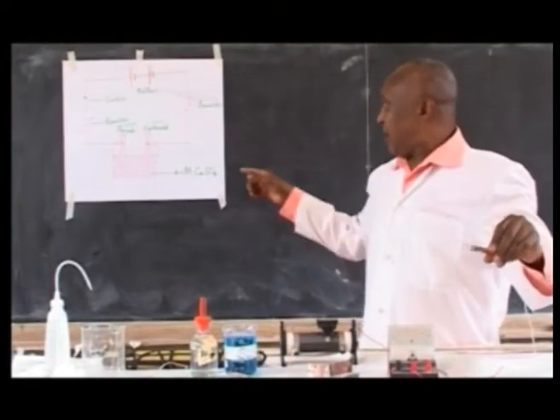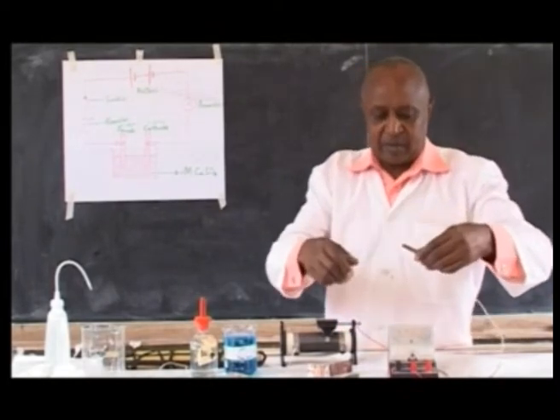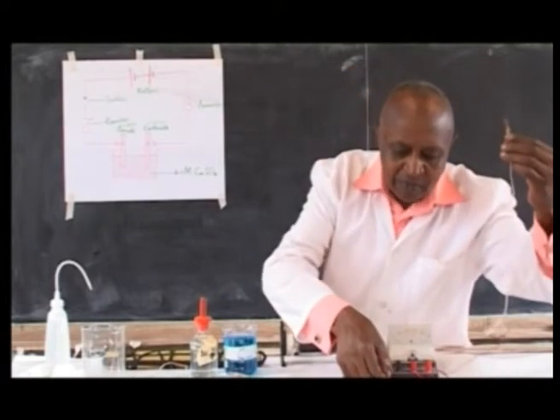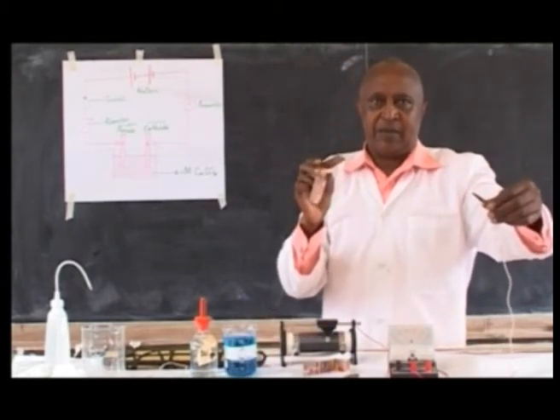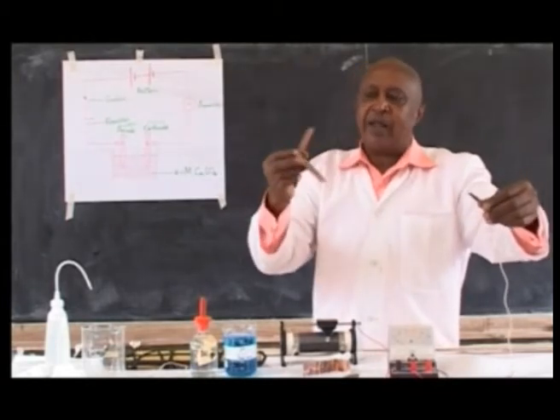Then the crocodile clips on the electrodes, and make sure that you fix the right crocodile clip on the right electrode. Otherwise, you will go the other way around.